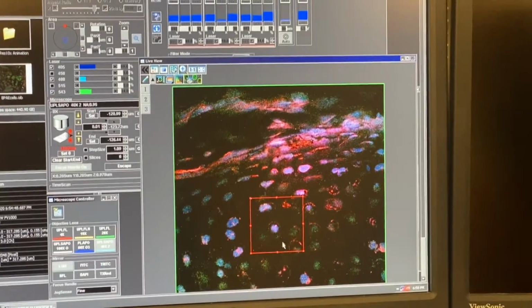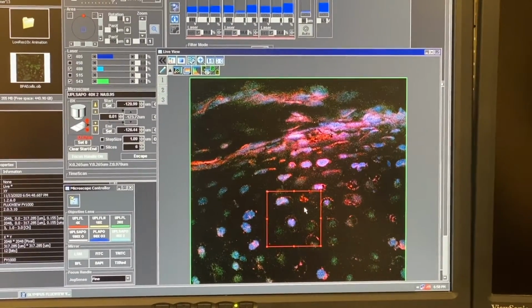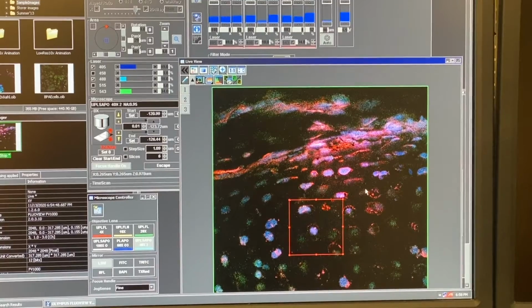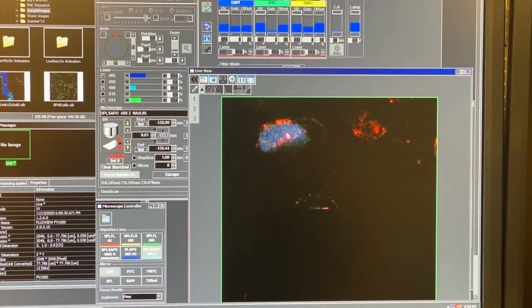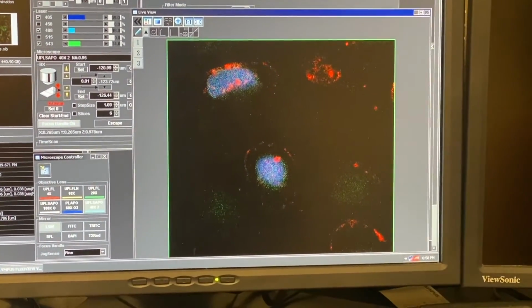I'll look at just these 5 cells that are in the plane of focus. Now there's a lot of cells underneath them that would also be glowing, but we don't get to see those in confocal until we make it three-dimensional. So let's go ahead and focus 4x at that smaller region. Look at the green versus the blue.